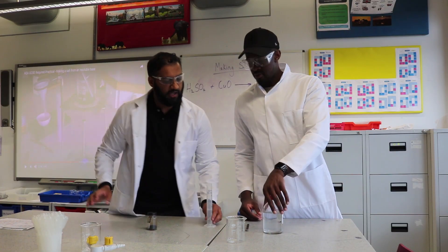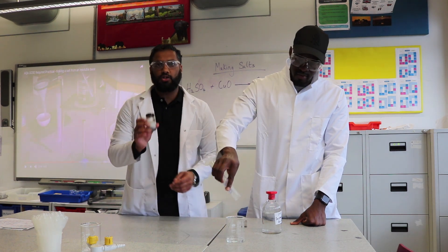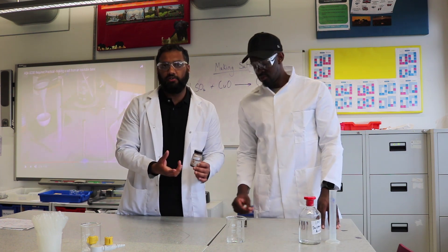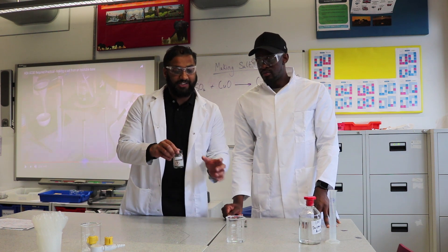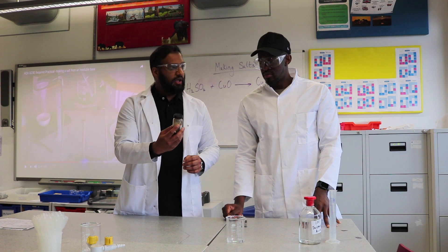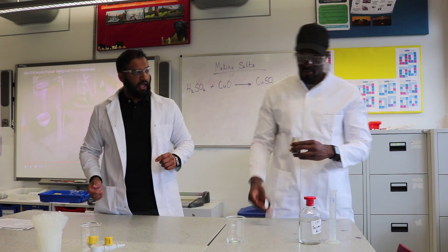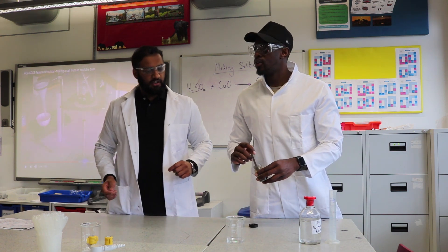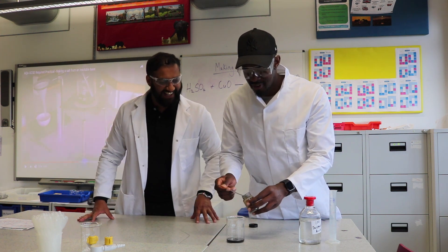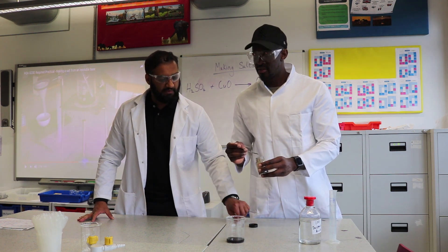Now we're going to add the acid to the beaker. We're using copper oxide in excess because this is a neutralization reaction — all the sulfuric acid should be used up. Add roughly three spatulas of copper oxide and stir it.